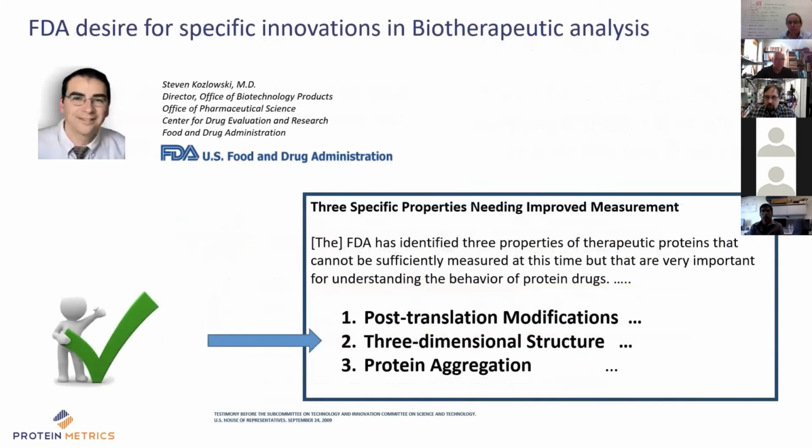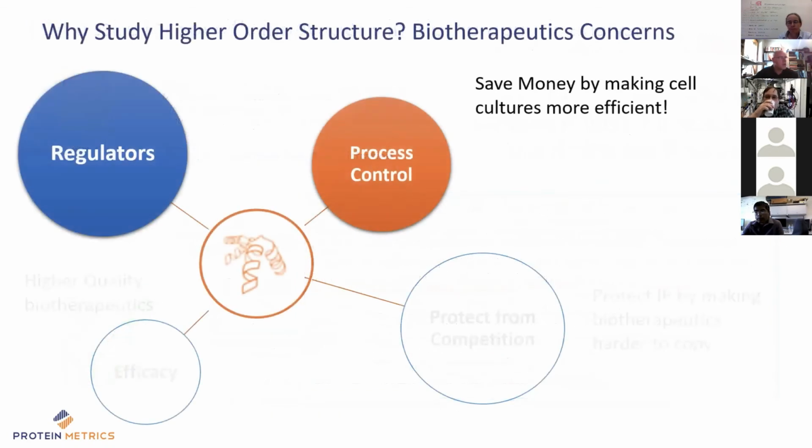Specifically, they went into a bit of head scratching back in 2009 to 2014, going through what exactly we should be doing with biotherapeutics. They realized, well, yes, we do really need to have this as part of footprinting the molecules overall. And it became much more obvious to people in the FDA that three-dimensional structure really had to be properly understood. Inside industry, of course, it's absolutely critical, because it gives you a whole lot more control of your processes if you have the right overall three-dimensional structures.